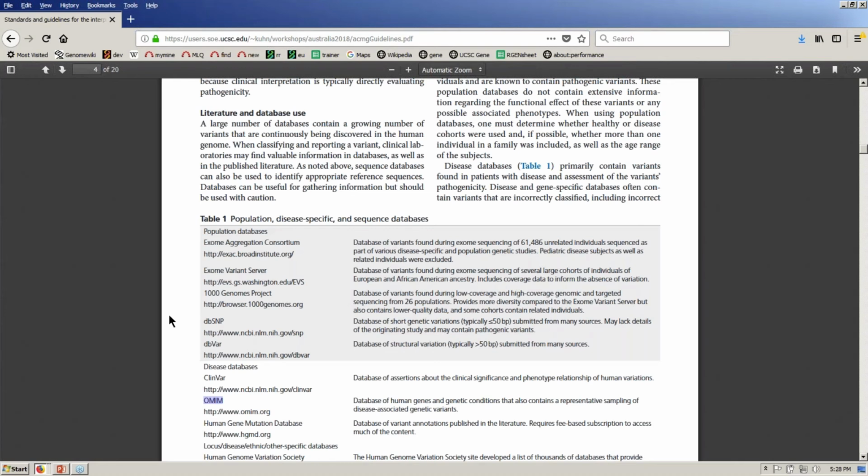And I showed yesterday a record from OMIM. So you can see that we give you a tick mark on the browser. We give you a small amount of data when you click into the item on the browser, but then we give you a link back to OMIM, which gives you the richness of the entire data set available to you. You can see everything that they've got.